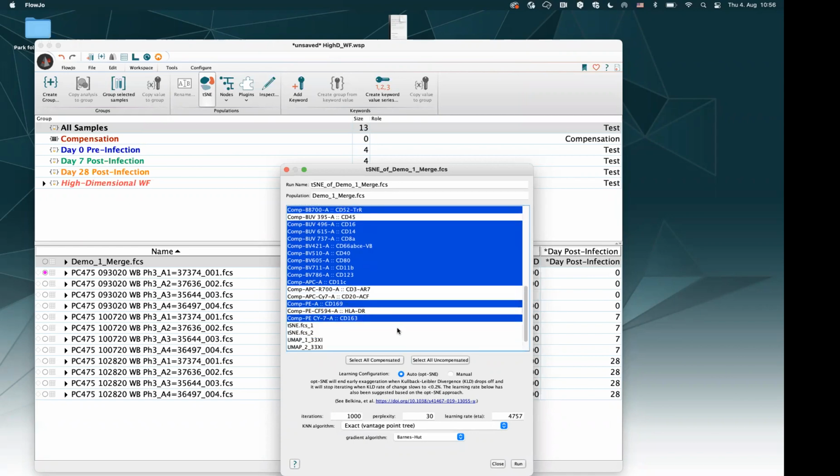And there are, of course, some tunables below that you can use, in case you don't get a good separation of the islands, or if your tSNE looks bad. You can always change the iteration, the perplexity and the algorithms that you will use for your testing. I would suggest starting as it is, and if you observe weird structures on your tSNE or anything that doesn't make sense, you can start thinking of adjusting those values.